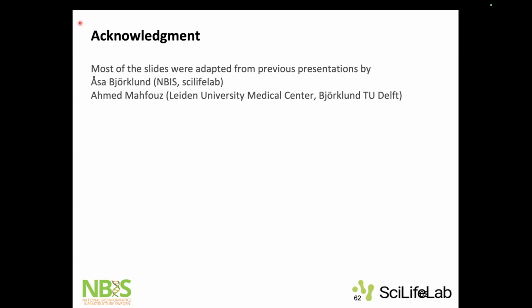Okay. And regarding the techniques that you mentioned when you were showing this slide, sometimes you have Smart-seq and 10x. Do we have to test different techniques to see if the labels are transferred, or do you suggest that if I have 10x data, I should always try to see if there is a 10x reference available and use that? I think so, yeah. I would do that.